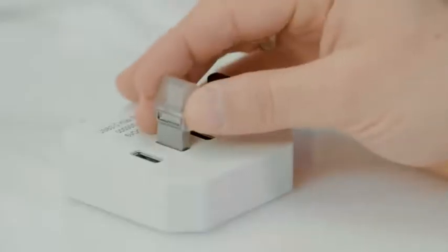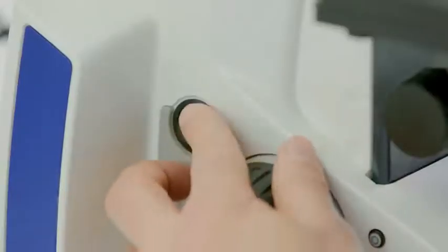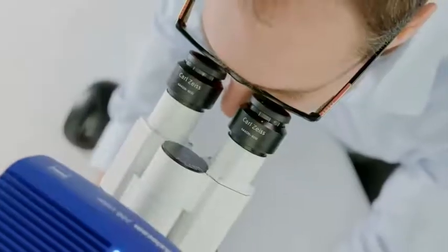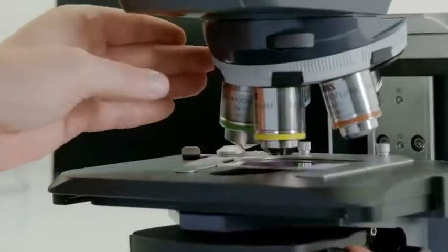Insert a USB stick into your Smart Axiocam 208 microscope camera. Switch on the microscope and place your sample on the stage. Use a low magnification objective to focus your region of interest, then switch to the magnification you need.